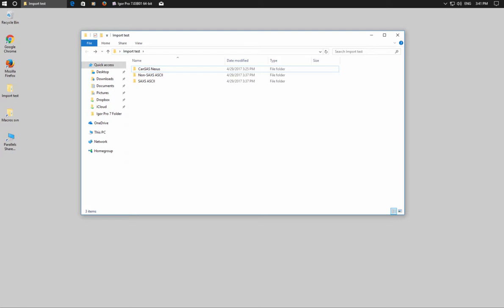Hello, this is a short movie which will provide instructions on how to import data into Irena. We'll be importing various types of data using the different Irena importers which you can find. So let me first talk about the data which we're going to have.